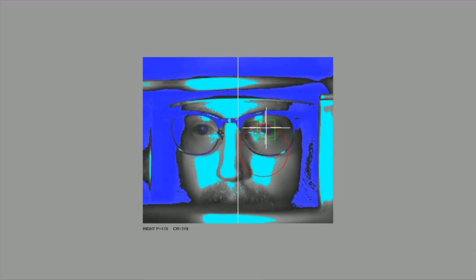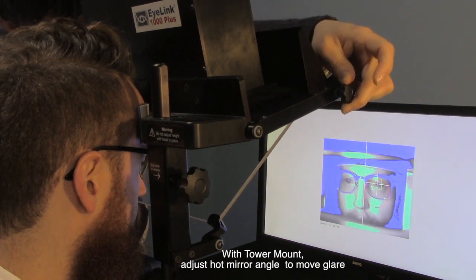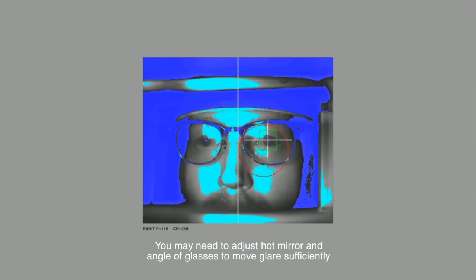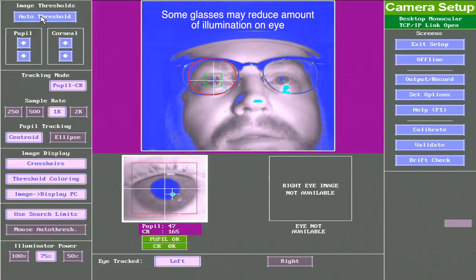If you're using the tower mount, you can also adjust the angle of the hot mirror to move the glare away. Loosen the knobs on the sides of the hot mirror, then gently raise or lower the mirror housing until the glare moves away from the pupil. Then tighten the knobs. You may need to adjust both the mirror angle and the angle of the glasses to move the glare sufficiently. You may find that some glasses, particularly those with anti-glare coatings, may reduce the amount of illumination that reaches the eye.